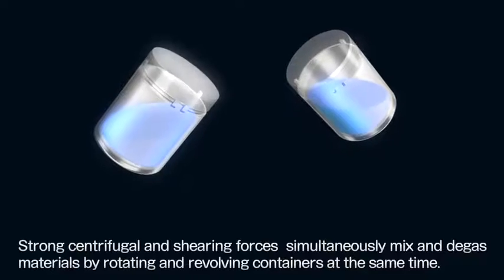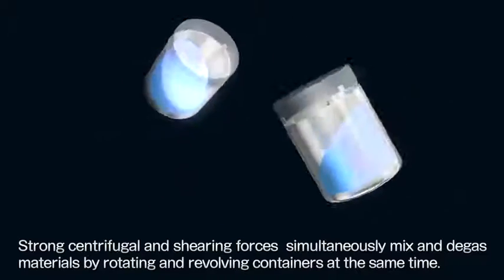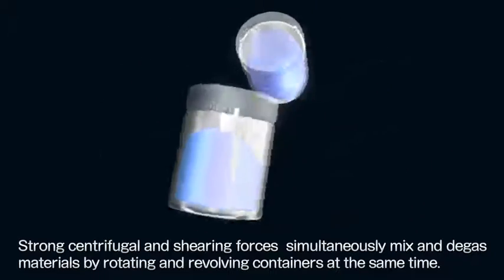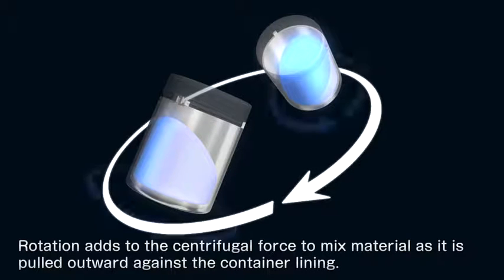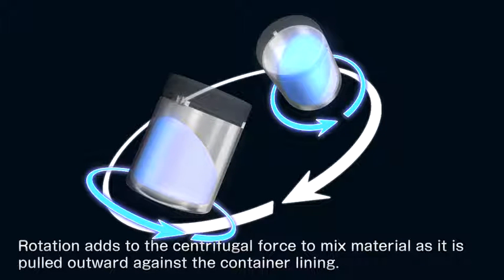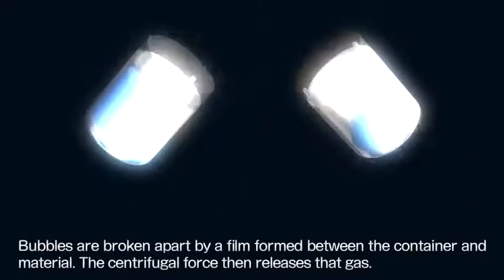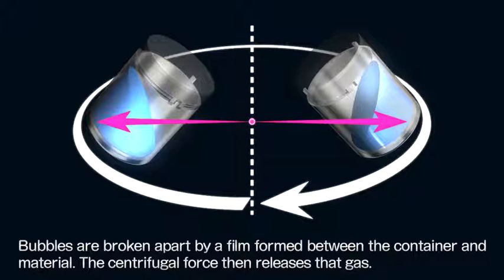Strong centrifugal and shearing forces simultaneously mix and degass materials by rotating and revolving containers at the same time. By adding rotation to the centrifugal force generated by revolving the containers, the unit mixes material by pulling it outward against the container lining. Low viscosity material is additionally mixed by swirling action. Bubbles are broken apart by a film formed between the container and material, and the centrifugal force then releases that gas.